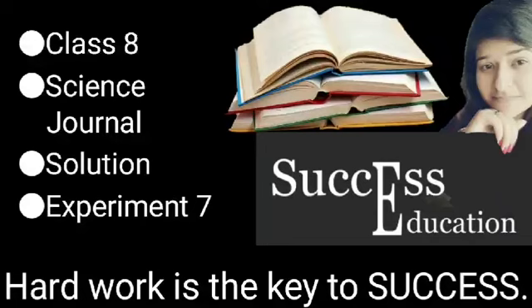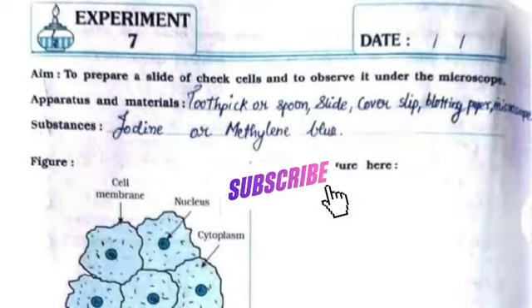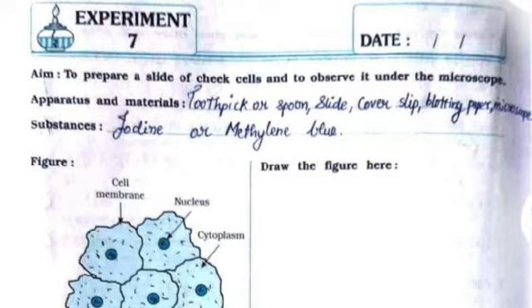In this video, we'll see the solution for Science Journal for Standard 8, experiment number 7. The aim is to prepare a slide of cheek cells and to observe it under the microscope. The apparatus and materials are toothpick or spoon, slide, cover slip, blotting paper and microscope, and the substances to be used are iodine or methylene blue. And you need to draw the same figure on the right hand side where the space is given.